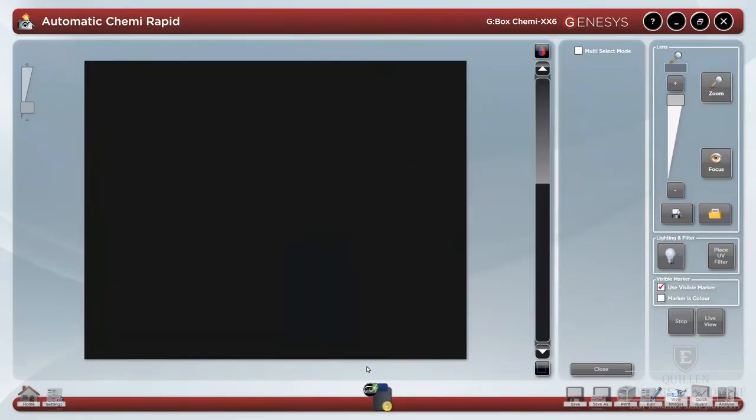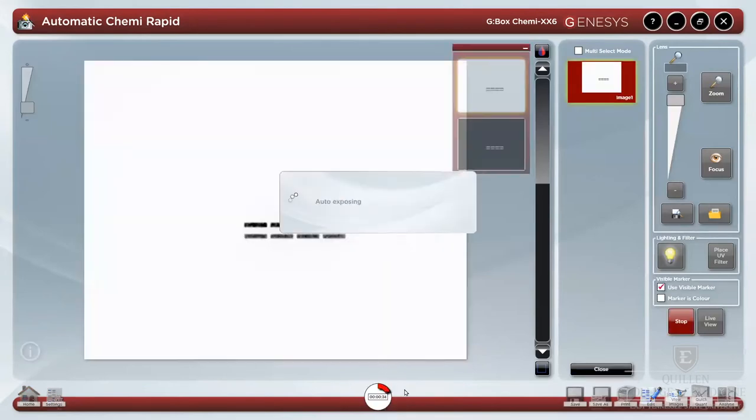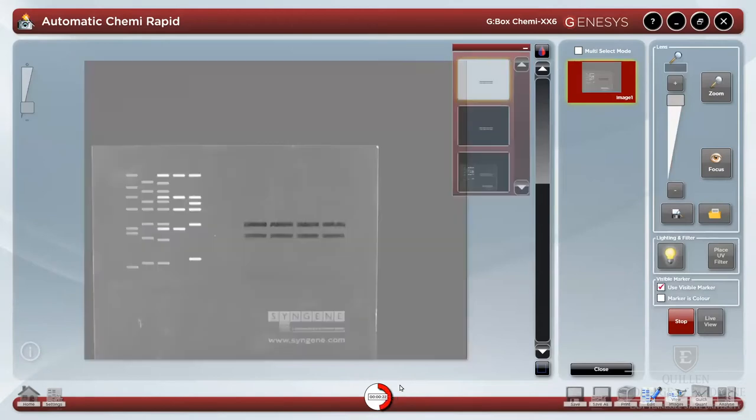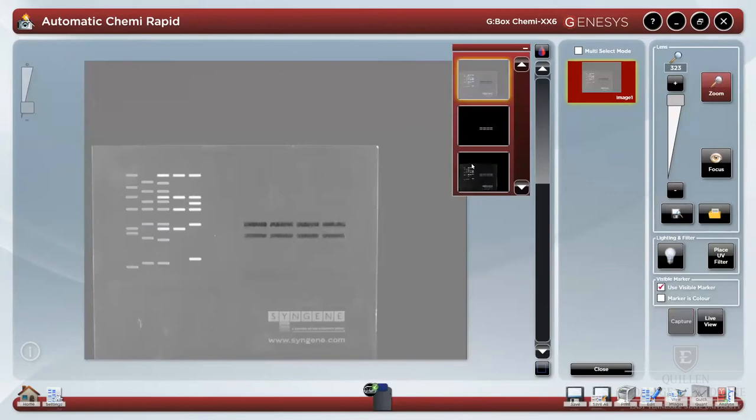Exposure calculations will immediately begin and can be seen on the status icon. Select your image to see the final exposure.